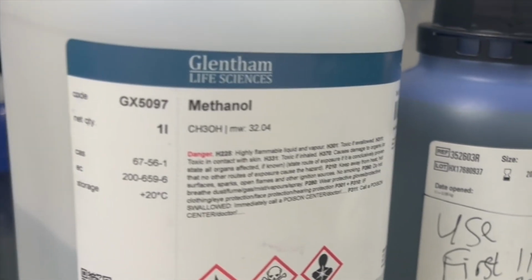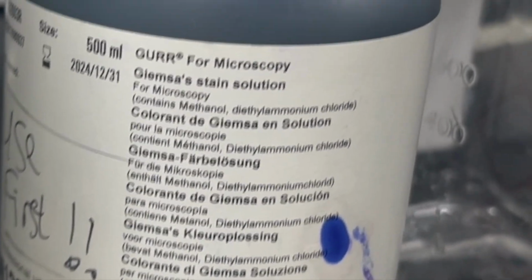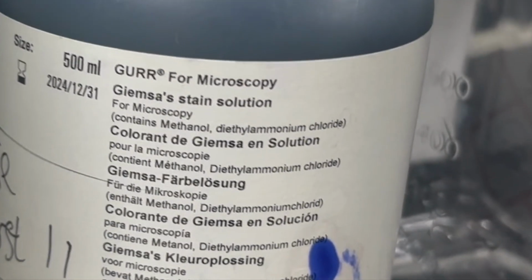Then you move to the Giemsa dye. This is where in the rapid setting, they're just putting it on at 10% for 10 minutes. But in the research setting, they're going from 30 minutes to 45 minutes and even more.